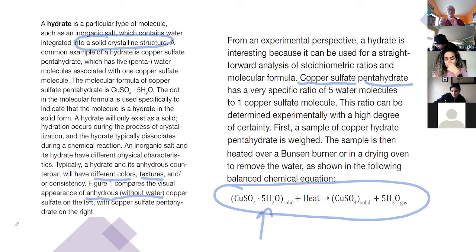But all it takes to break this bond is just some heat, which is different from a covalent bond, for instance. Just heat generally isn't enough to break a covalent bond. You have to have some sort of a reaction involving electrons being either given to somebody or taken away from somebody else to break a bond. In this instance, just the heat alone breaks it, sort of like an ionic bond. If you give it enough heat, you can force those two molecules apart.